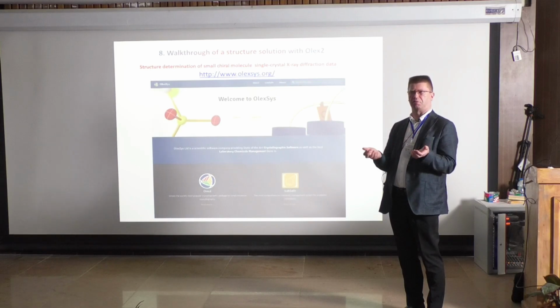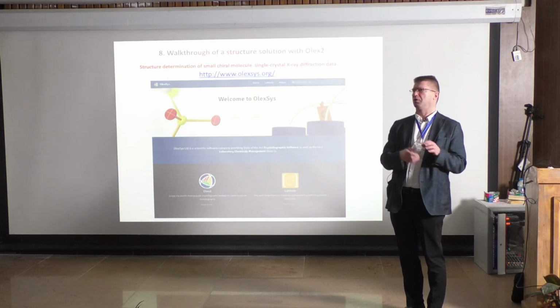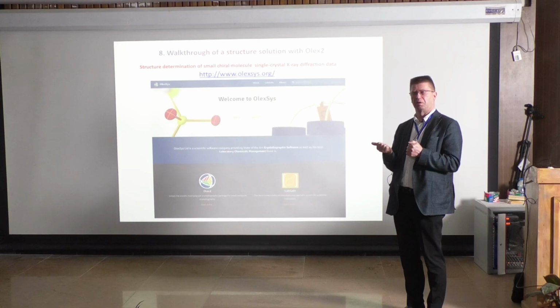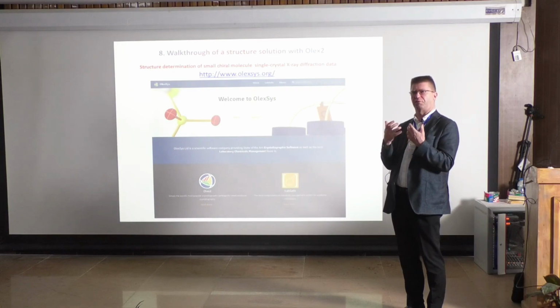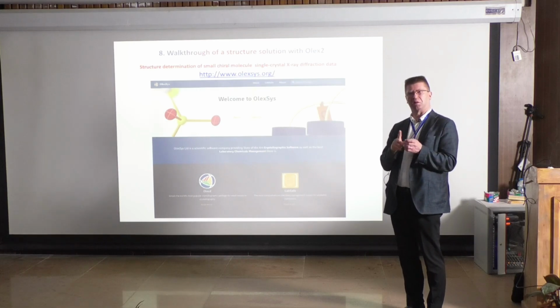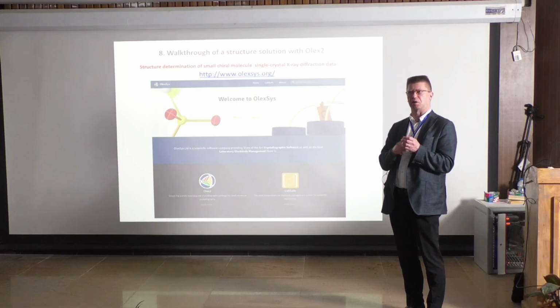And then you can see actually what comes out. How is the real work done with the programs? And that's the reason why I don't go into the mathematics of the theory part, because the computer programs are nowadays so sophisticated, we don't have to worry about it. They know what to do. And it's our business just to follow and see that, okay, is this correct? Because one important point there is that the X-rays don't know the atoms. They only know the electron density. And this comes out from the programs.